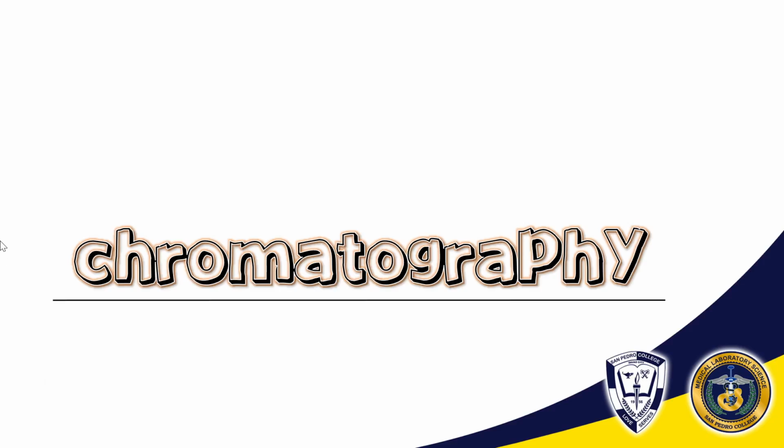Hi kids, so now we proceed to the second part of our discussion in your topic 6, and that is all about chromatography. So nalalantay duha na nabilin, chromatography and your mass spectrometry.